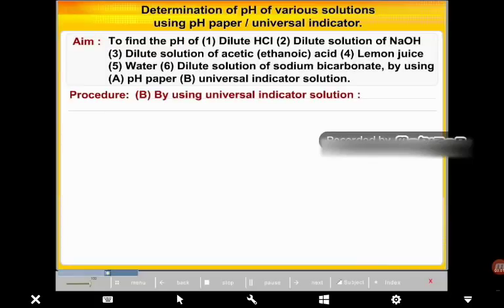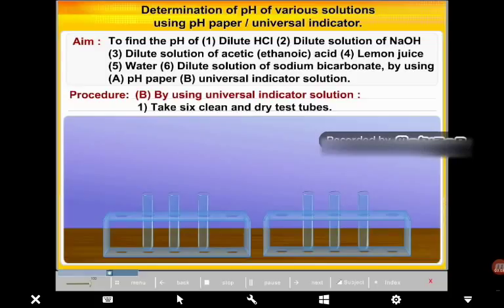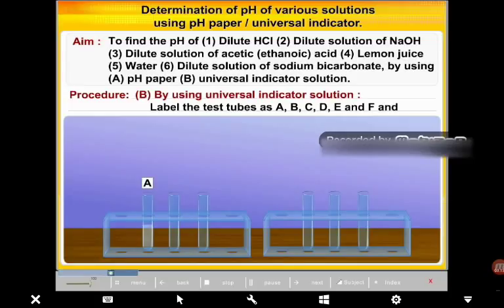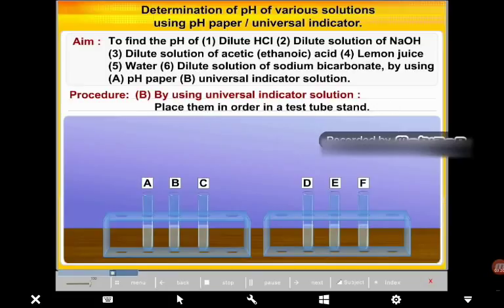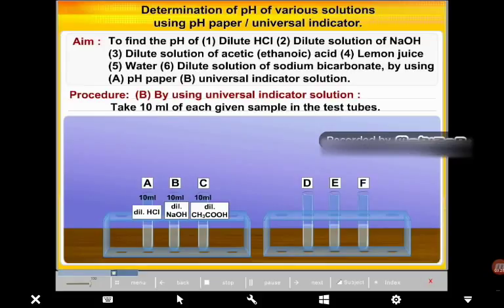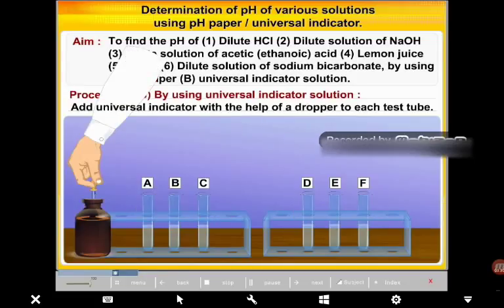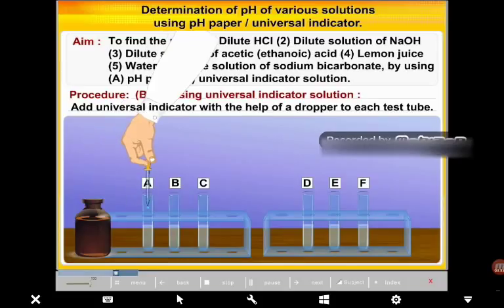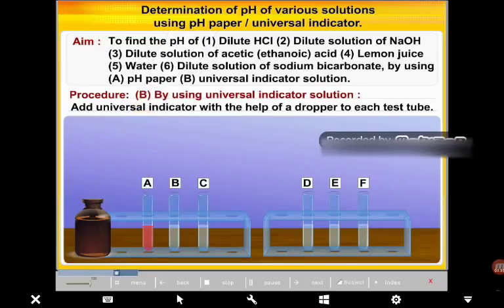Procedure B: By using Universal Indicator Solution. Take 6 clean and dry test tubes. Label them as A, B, C, D, E, and F, and place them in order in a test tube stand. Take 10 ml of each given sample in the respective test tubes. Add 2 drops of BDH Universal Indicator (BDH stands for British Drug Houses) with the help of a dropper to each test tube.